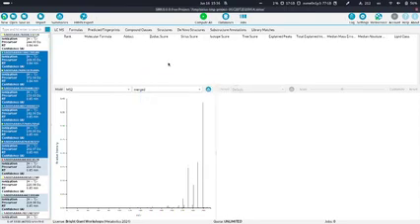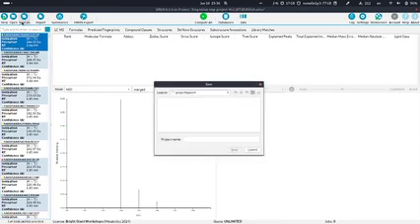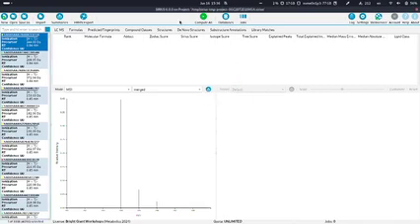Yeah. But first, what I want to show you very quickly is that if you've done some computations, it's a very good idea to save your project space somewhere. So just click on Save As. Just make a new folder and save it somewhere. I will not show it now, but often it's a very good idea. And you would see on the menu bar at the top the new project space location.